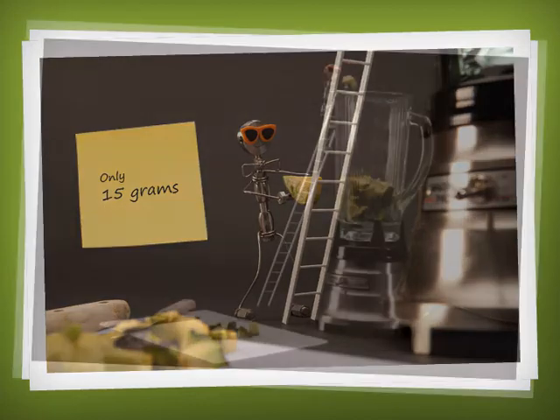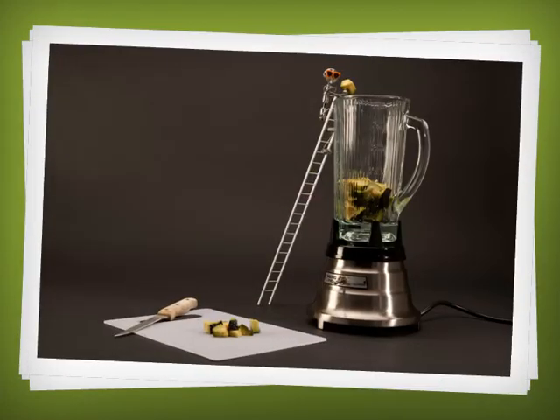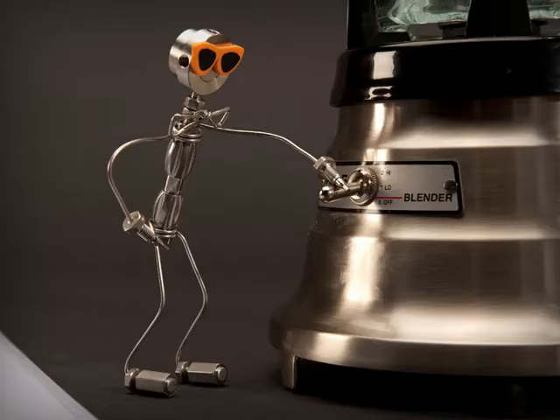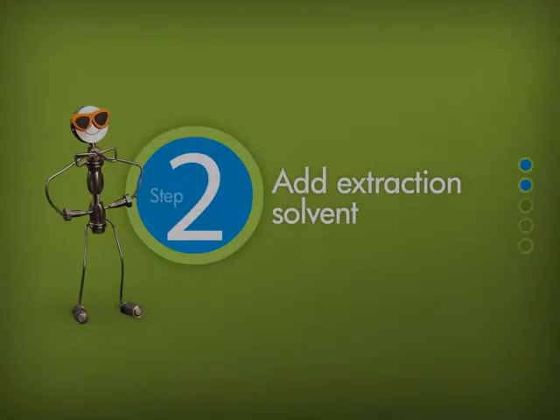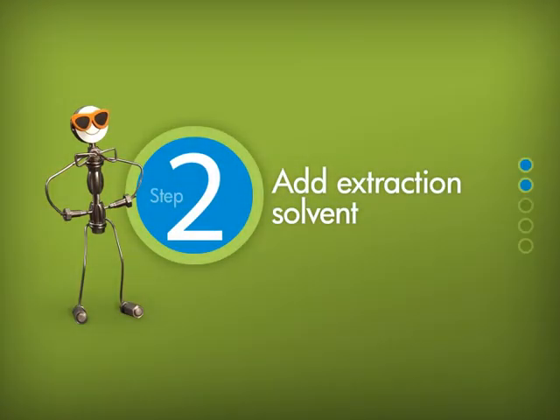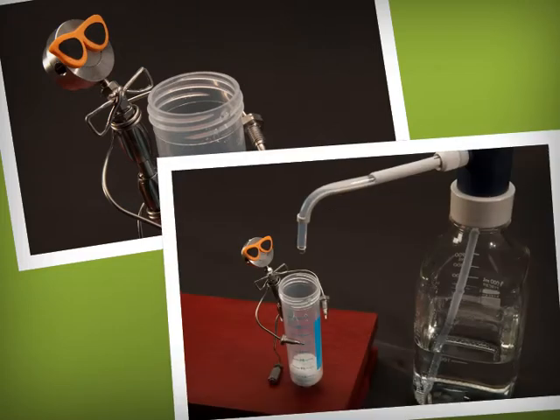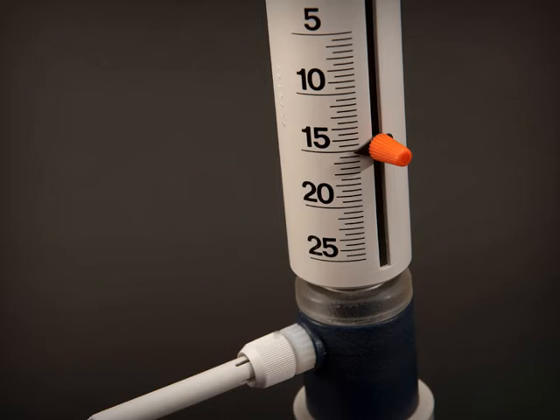Homogenize the sample in a blender. You'll only need about 15 grams, which is far less than other extraction procedures. Now let's get the big extraction tube — we'll call this Tube 1. Add 15 milliliters of the extraction solvent.